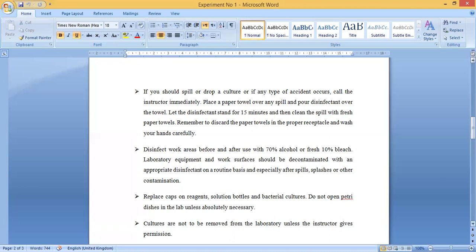Disinfect the work area before and after use with 70% alcohol and fresh 10% bleach. This is the composition of disinfectant that must be used to clean your bench top or workstation. Laboratory equipment and work surfaces should be decontaminated with an appropriate disinfectant on a routine basis and especially after spills, accidents, splashes, or other contamination.